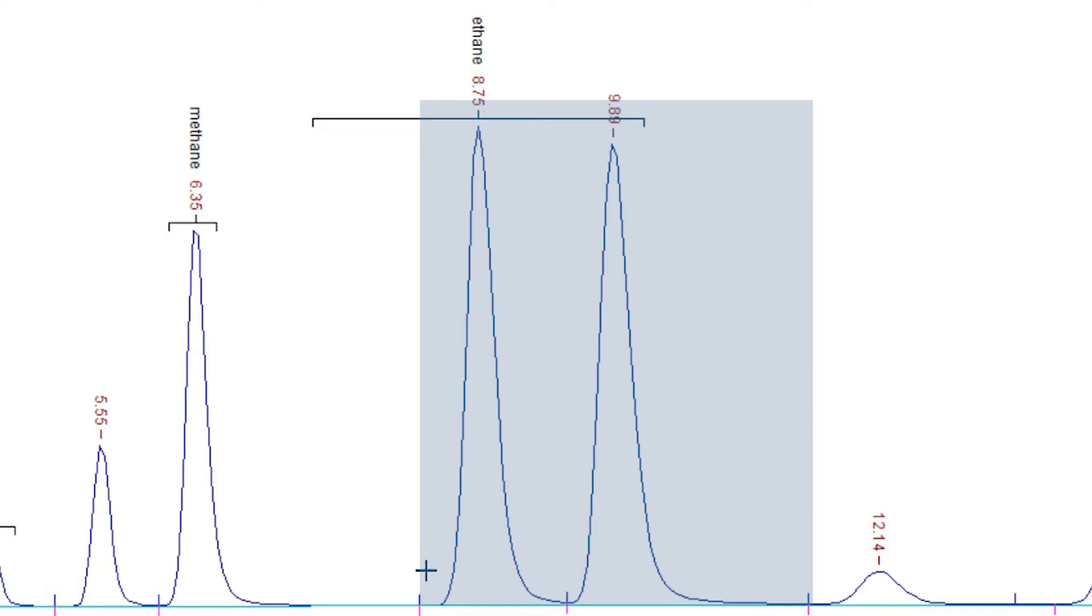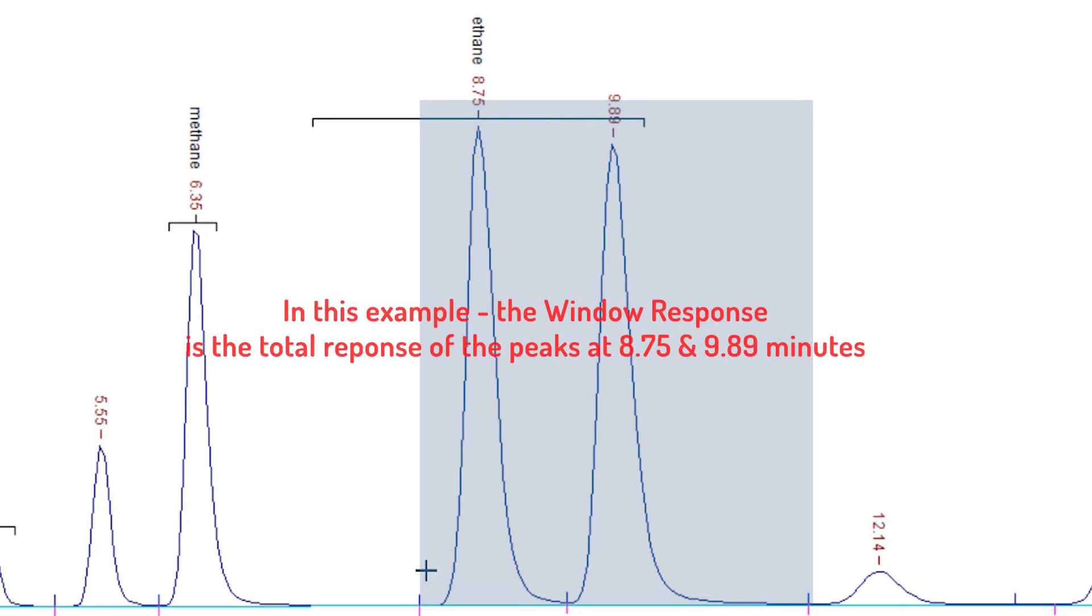In addition to calculating amounts for each identified peak in the chromatogram, the integration algorithm also calculates, for each component, the sum of the responses, either areas or heights, of all peaks that lie within the search window. This sum is the window response for the component. Next, using the component's calibration curve, the integration algorithm calculates the window amount for the component.